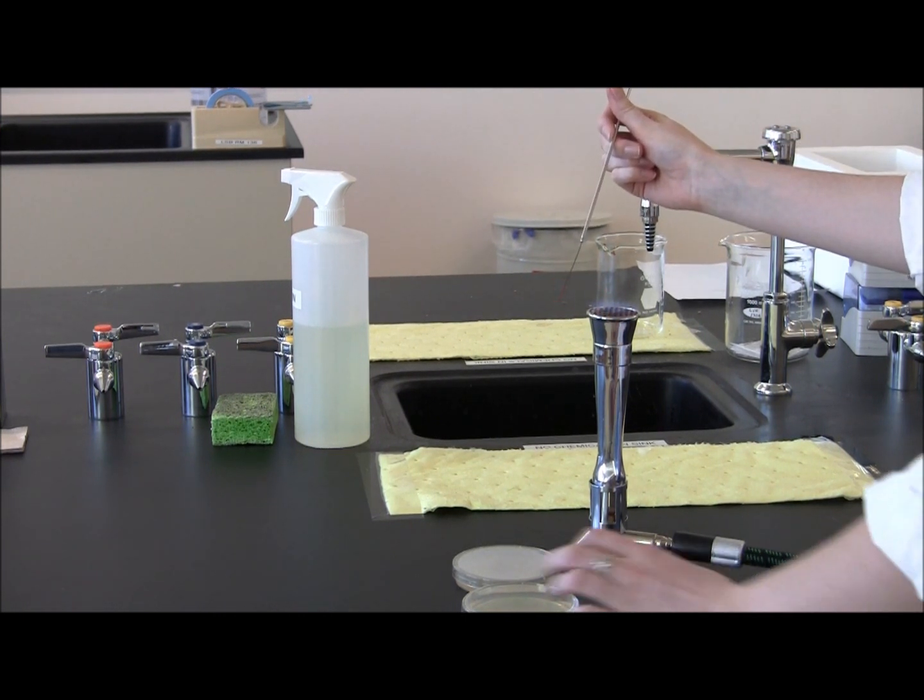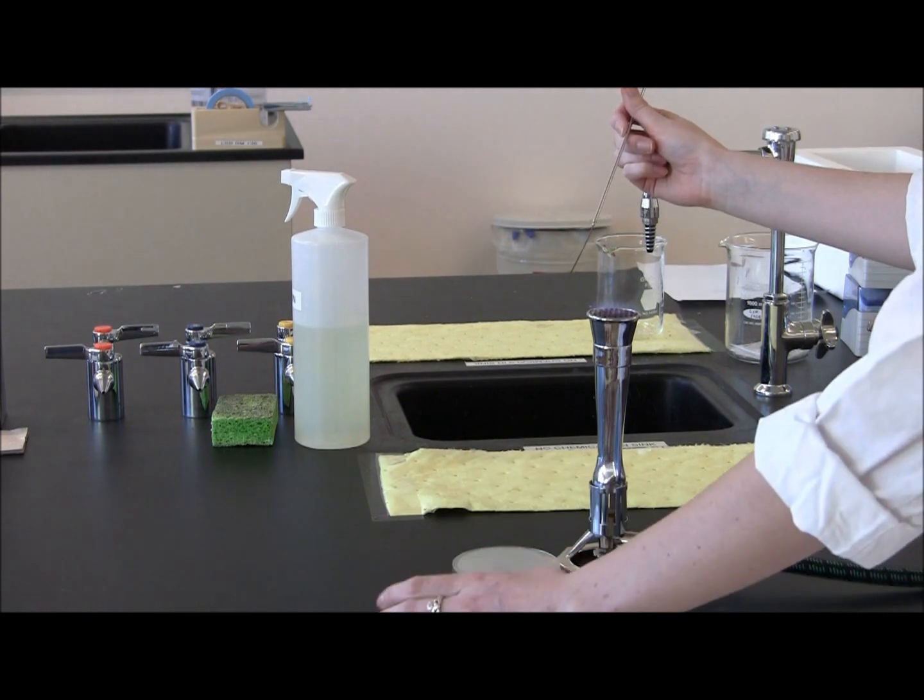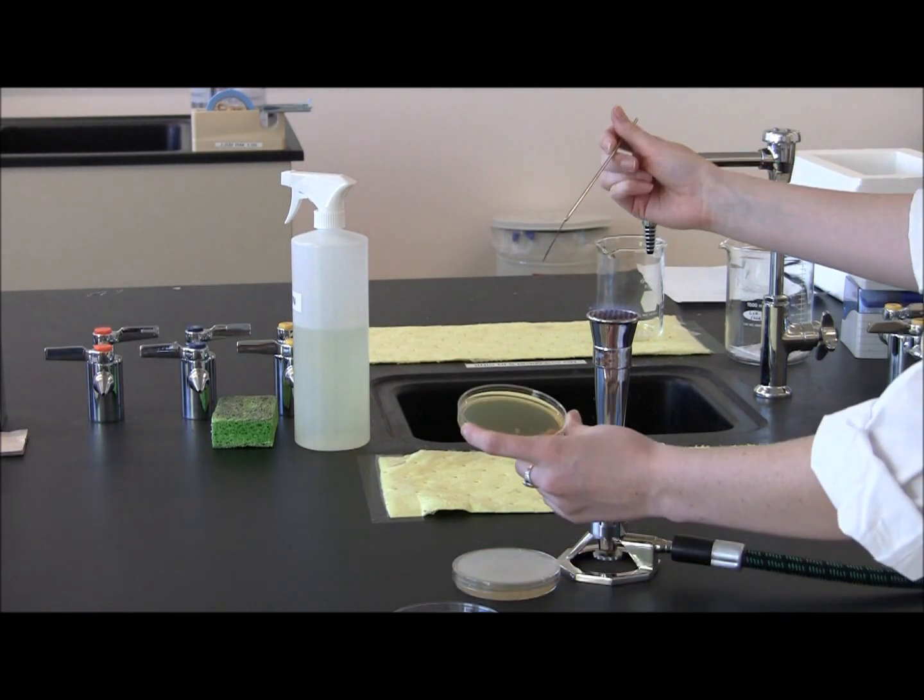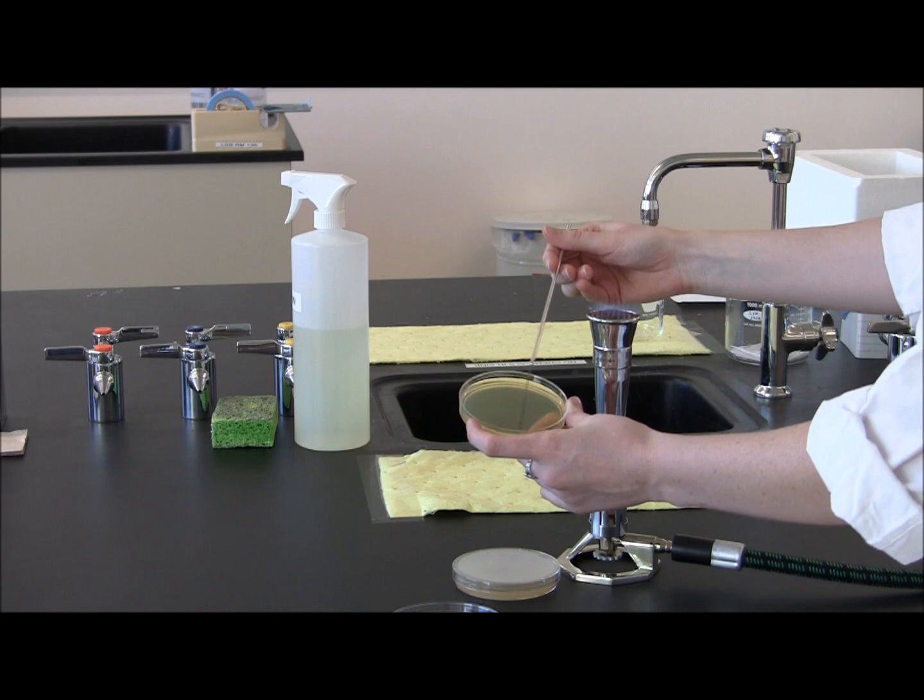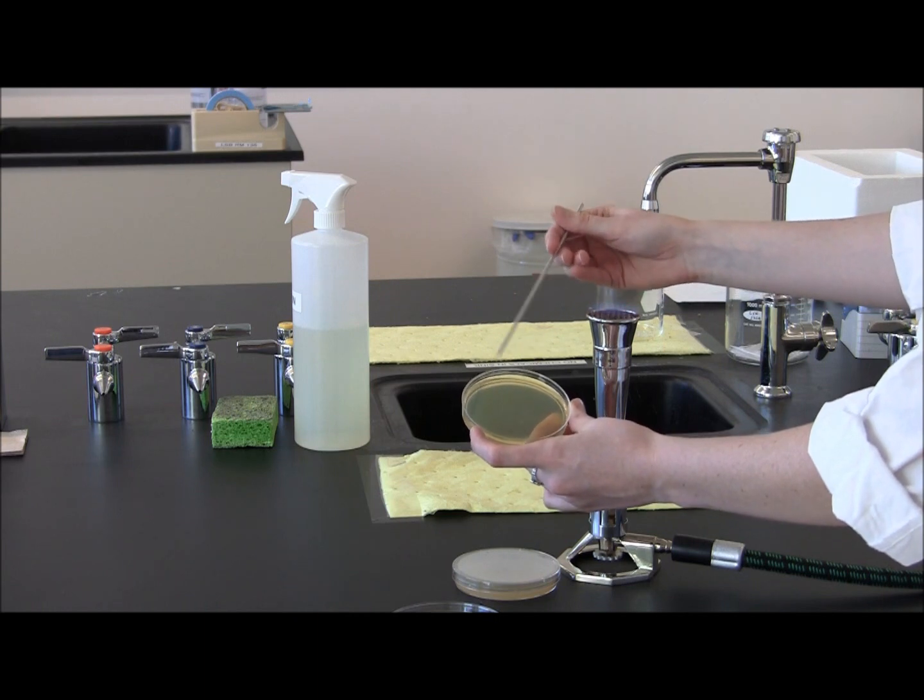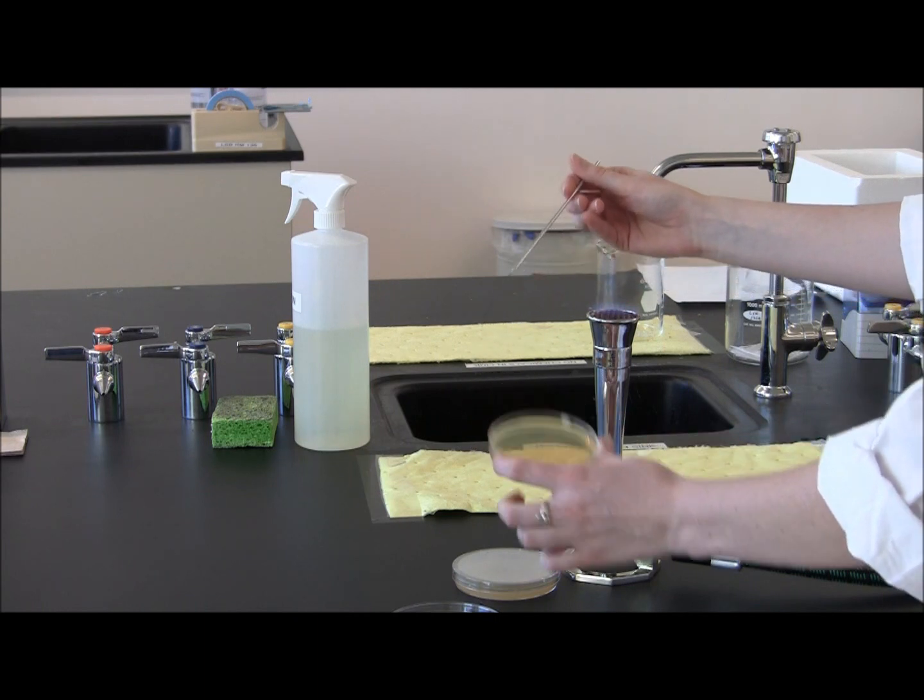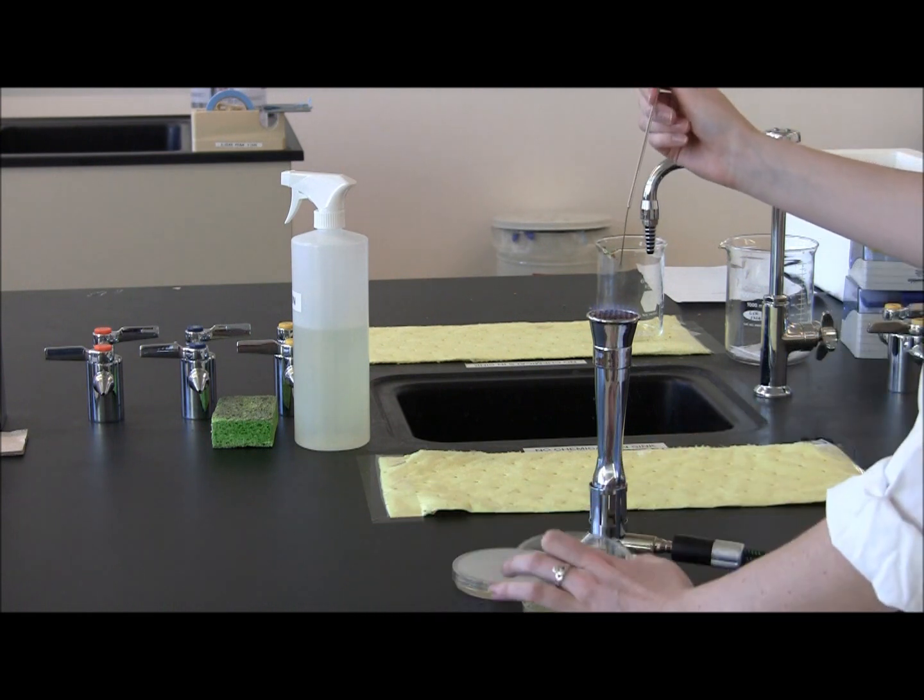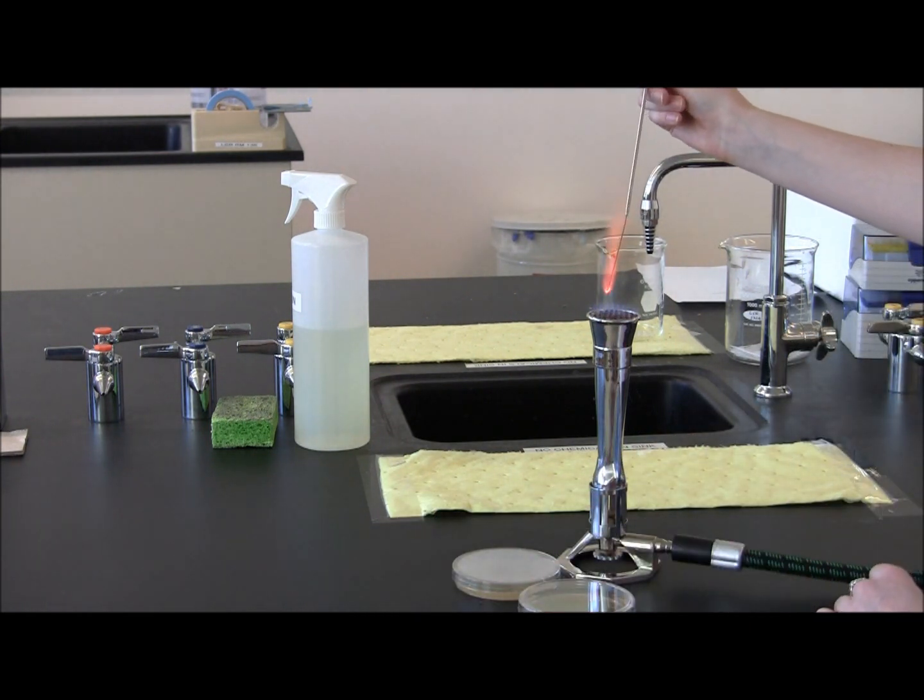Allow the loop to cool briefly, then remove the cover and do your second quadrant streak. Replace the cover and flame your loop again until it is red hot.